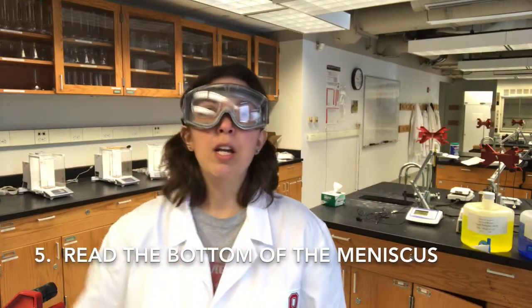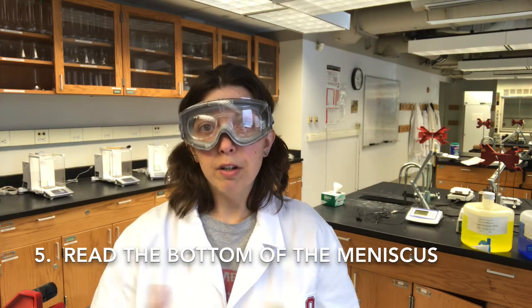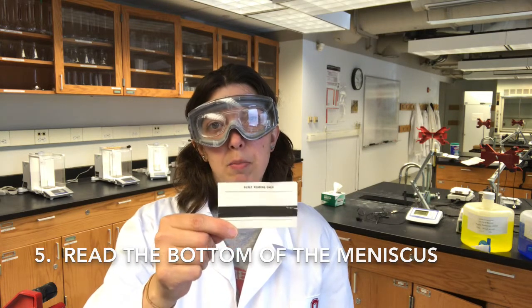Tip number five: make sure you're reading the bottom of the meniscus of the solution. Use a burette reading card to help you get a really good sense of where that meniscus bottom is.